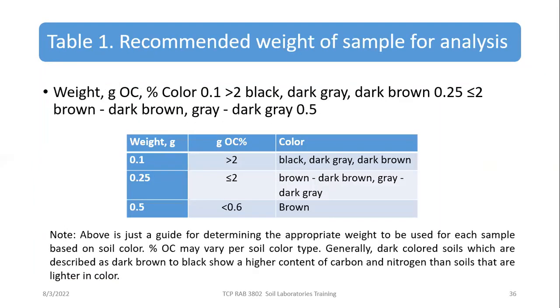We can go to Table 1. Here, the weight varies from 0.1 gram to 0.5 gram, depending on the expected percent of organic carbon in the soil.